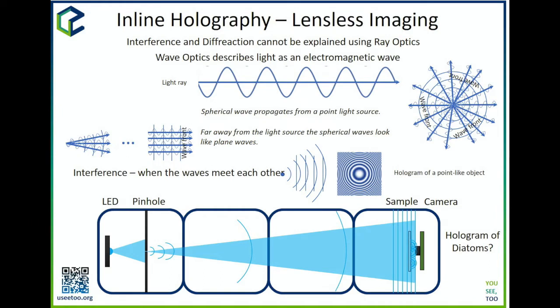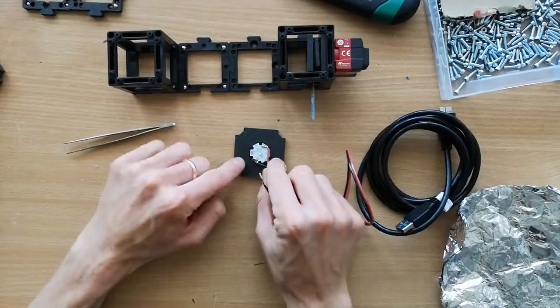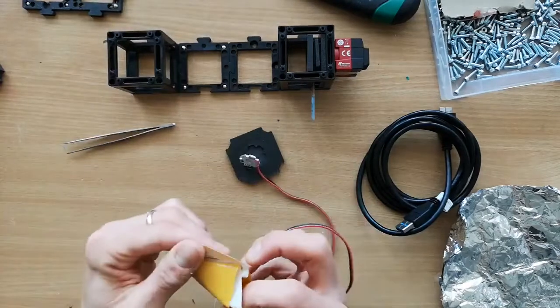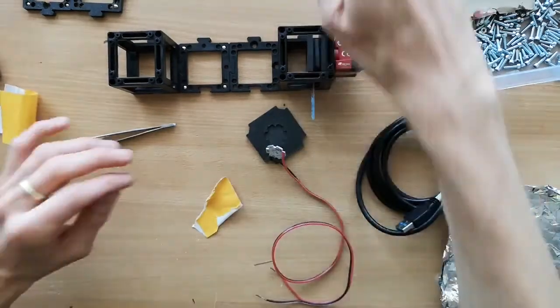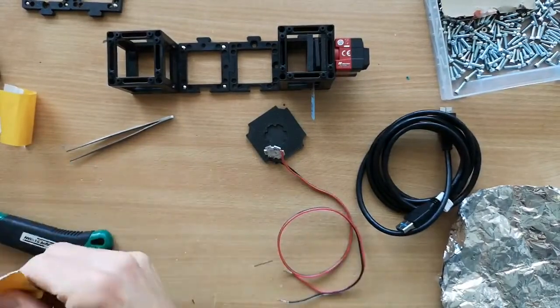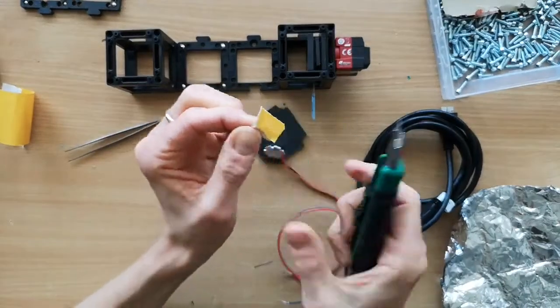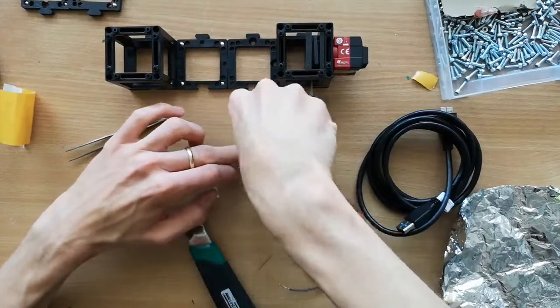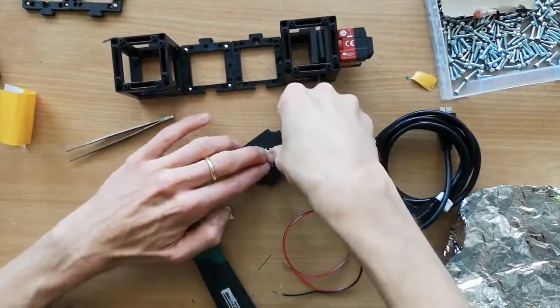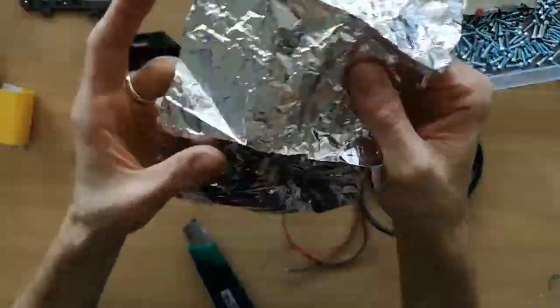On the other side, relatively far away, we want to place an LED. The LED is already soldered to wires — it's a high-intensity LED. We place it on the insert using double-sided sticky tape. We cut a little piece of the strong double-sided tape and place it on the LED insert so that the LED sits centrically. This becomes our LED insert.